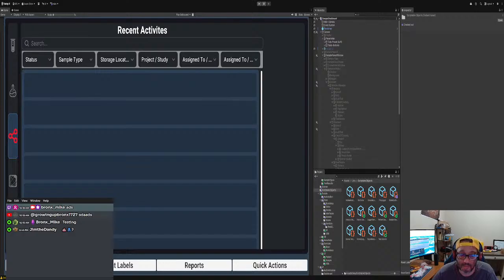We got the test name, and then you got to make sure you got these field names right, because if not, it won't work. It'll crash, not crash, but it'll tell you it's an error. You get an exception error. And then right here, we're using that service again to send the query. If it's a response, we're just testing to see if it's there or not. If it's there, then go on.